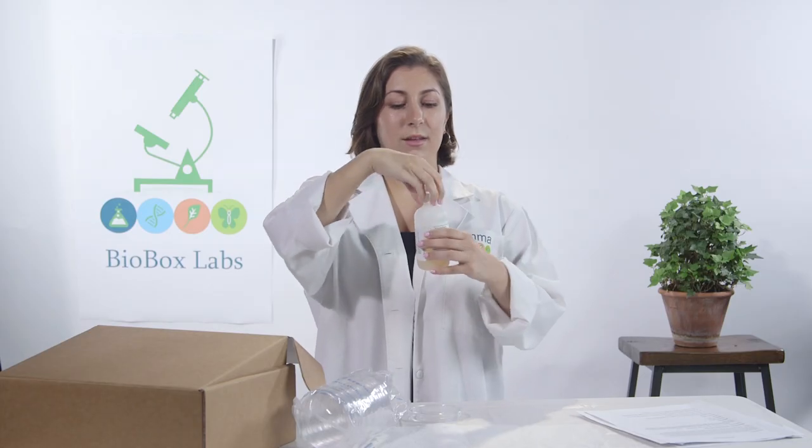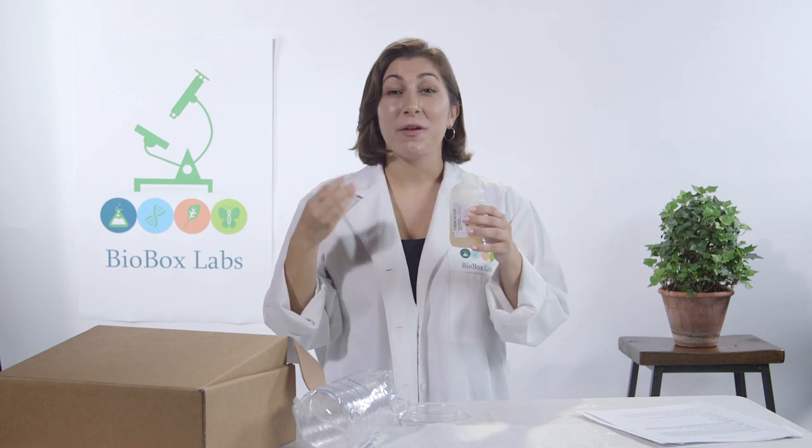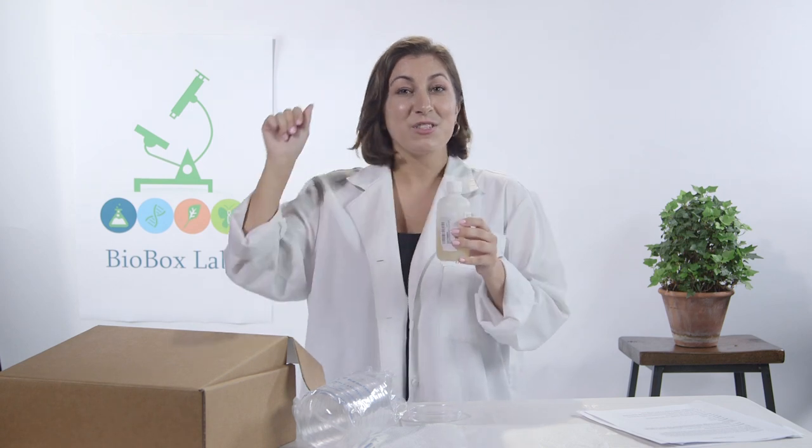So bacteria and fungus need food to grow, just like we do. So this will be their zoo, and the agar will be their food. We want to take the cap off and microwave it for 30 seconds, then take it out, swirl it a bit, and then 15 seconds more until it comes to a boil. But make sure it doesn't overboil — off to the microwave.